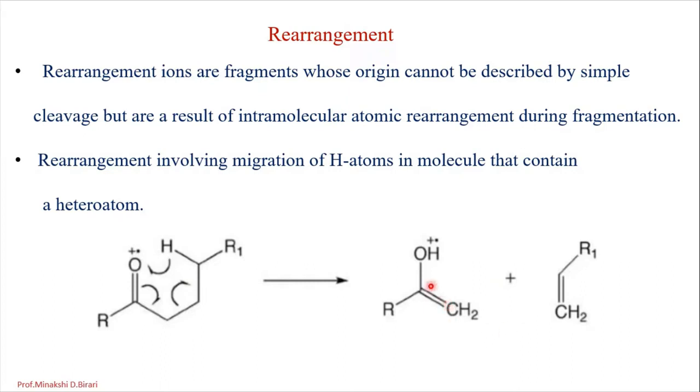So rearrangement ions are fragments whose origin cannot be described by simple cleavage, but are the result of intramolecular atomic rearrangement during fragmentation. And it is nothing but the migration of hydrogen atoms in a molecule that contains a heteroatom.